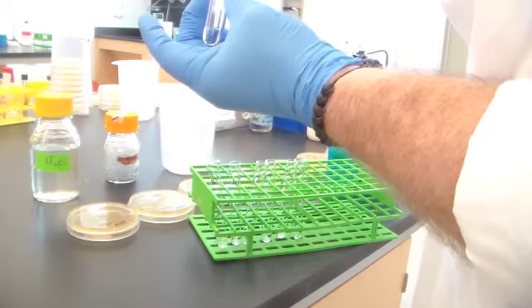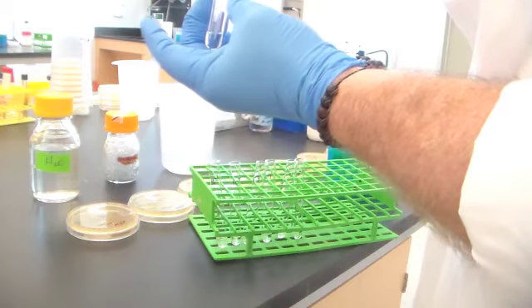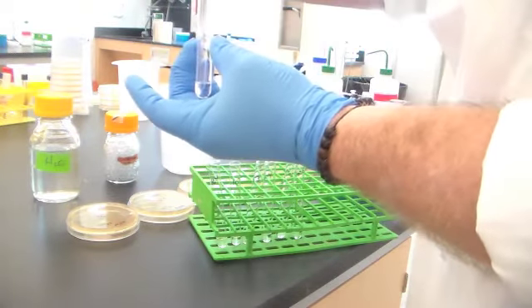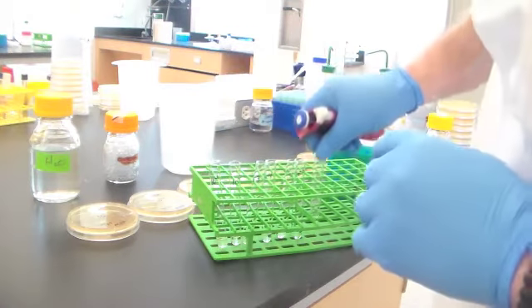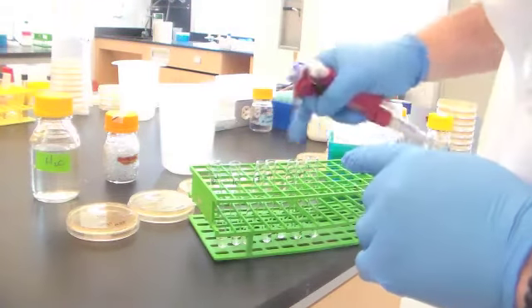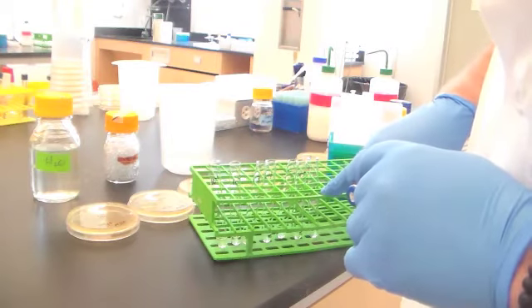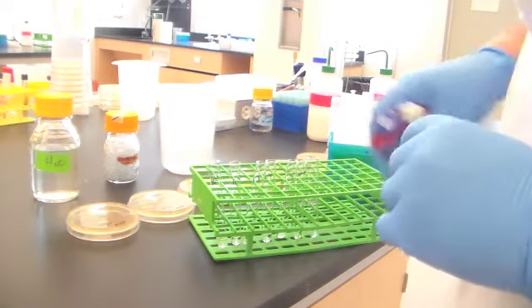And then once I go into the last one, just for good measure, I'm going to take out 100 microliters and discard it. That's just to make sure that all of these tubes have the same volume in them. They all have now 900 microliters of various dilutions.